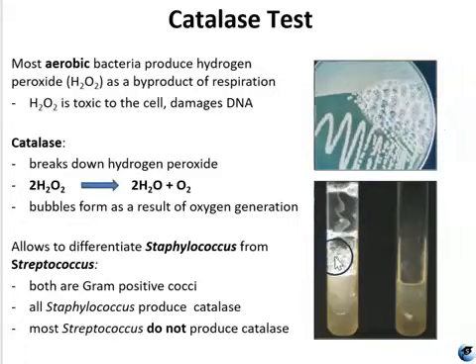And you've seen this before. If you have ever put hydrogen peroxide on a wound and you see the bubbling, well, that bubbling means that you have a bunch of staph in that wound. It also means that the hydrogen peroxide is not killing that staph, because it's turning the hydrogen peroxide into water and oxygen, right? So you have a positive catalase here, and then negative catalase here.